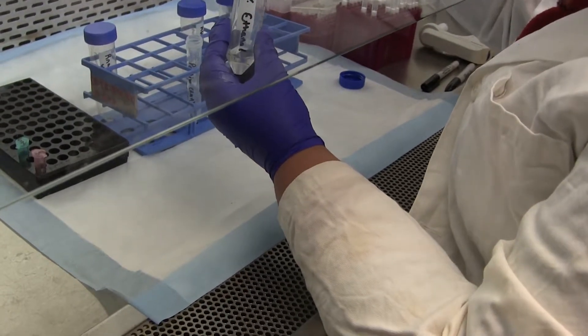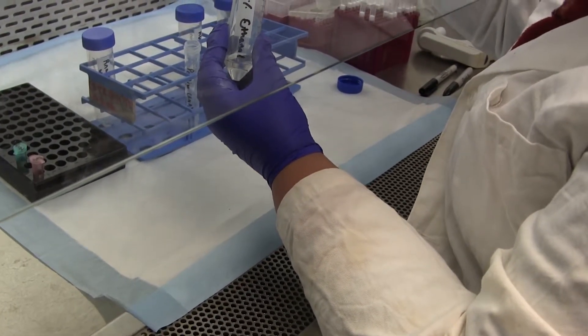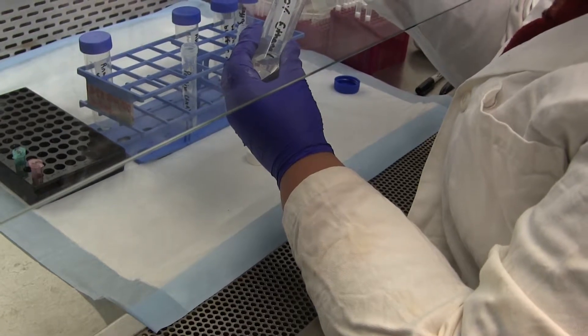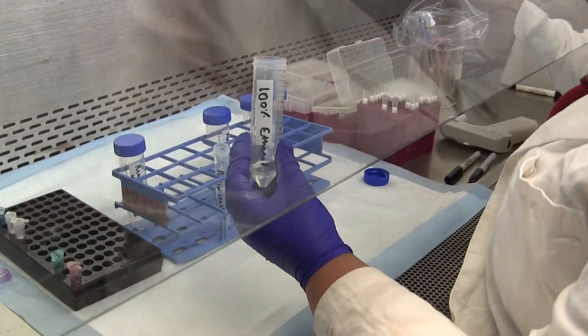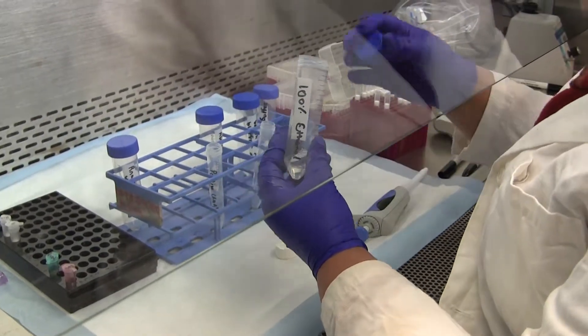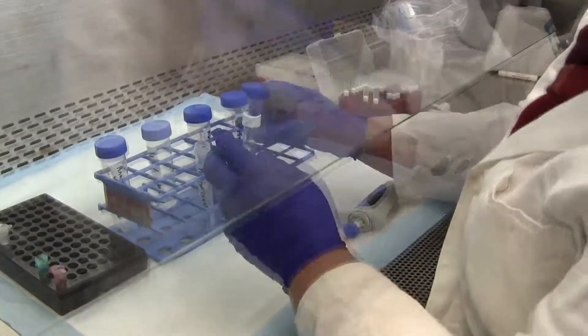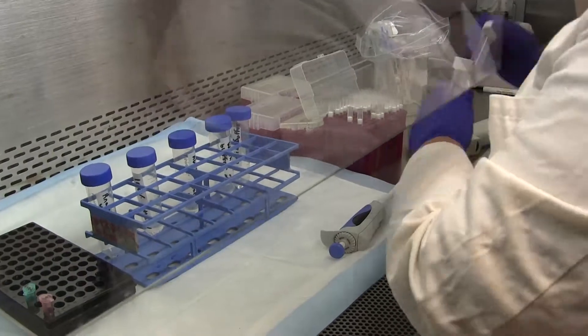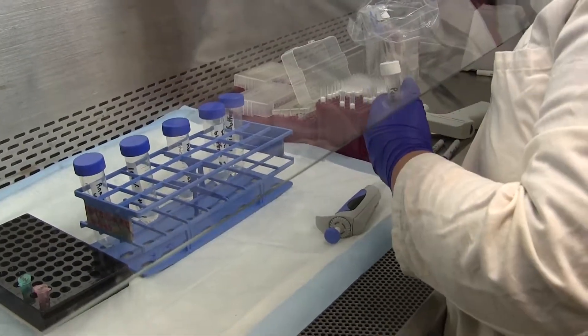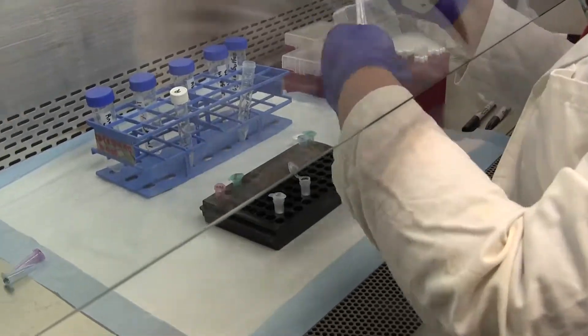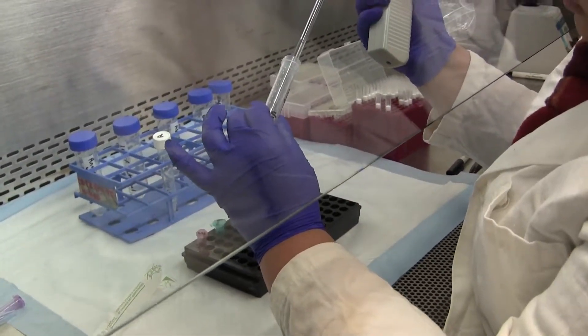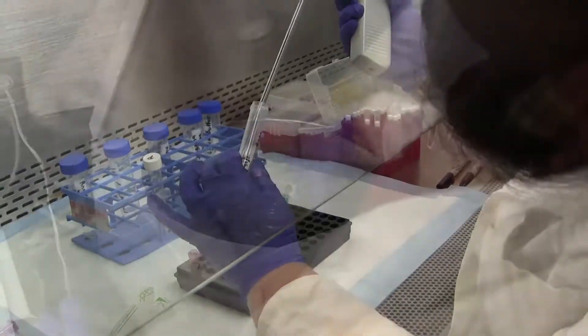Now we've got 750 microliters volume, so we're going to add 750 microliters of ethanol. And now we've got a total volume of 1.5 mils in each sample. I'm going to vortex briefly and then transfer 750 microliters at a time into the spin columns.